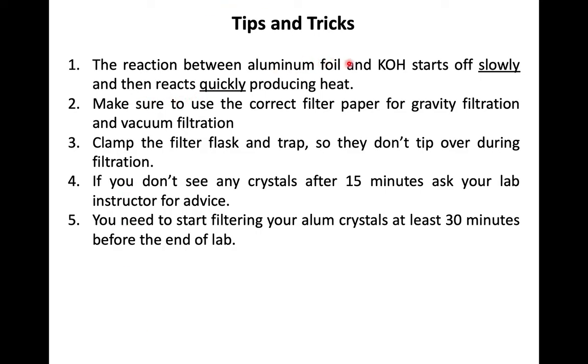The reaction between aluminum foil and KOH starts off very slowly, but then once it gets going, it reacts quickly and produces a lot of heat. You want to make sure to use the correct filter paper for gravity filtration and vacuum filtration. You want to make sure to clamp the filter flask and trap so they don't tip over during the filtration, losing your product. If you don't see any crystals form after 15 minutes, ask me or your lab instructor for advice. You need to start filtering your alum crystals at least 30 minutes before the end of lab in order to get them dry.